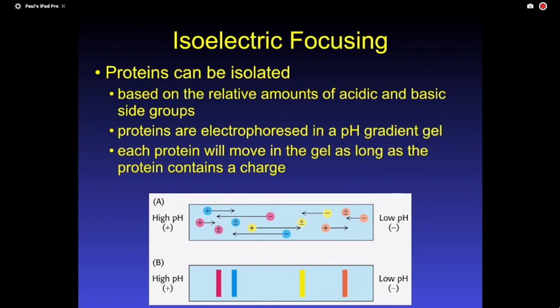Okay? This is how we usually calculate a PI for a protein. We don't actually go in and do a mathematical calculation, although you can. What we do is, this protein is at a pH of X. Well, its PI is that pH. And so we functionally identify proteins. And we have all sorts of proteins. If you don't have a lot of proteins, you can get wonderful separation. If you have a very complex mixture, it's separated, but it's messy. Okay, because you get so many in a short distance. And we can cut those out and we can isolate those, but we can separate based upon charge.